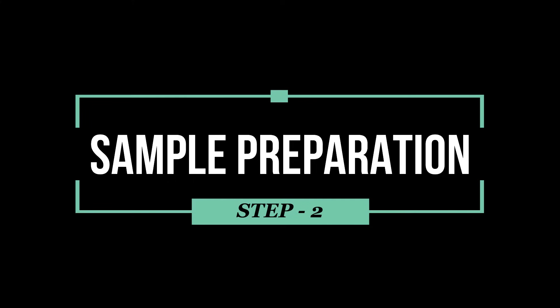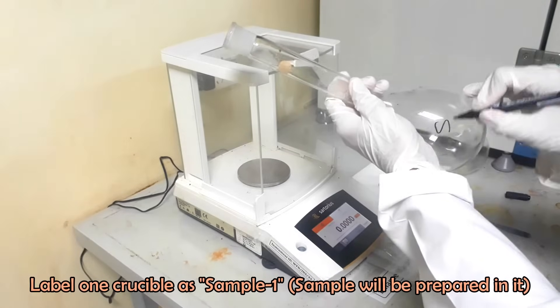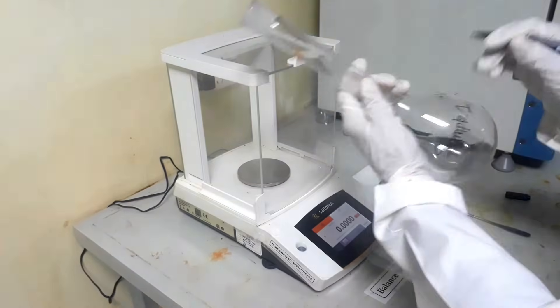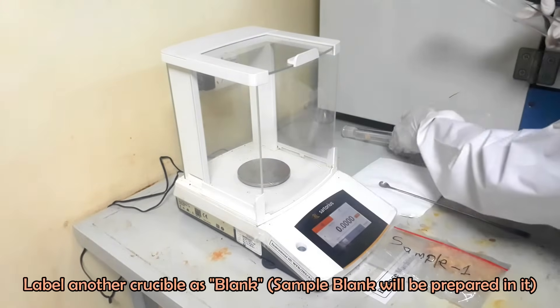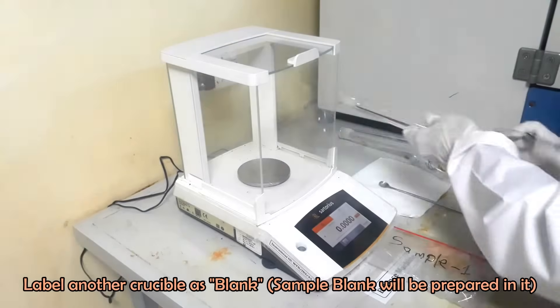In the sample preparation step, we will digest our sample by heating with acids. Take two properly cleaned and dried flasks. Label one flask with the sample ID — we will prepare the sample in it. Label another flask as blank.